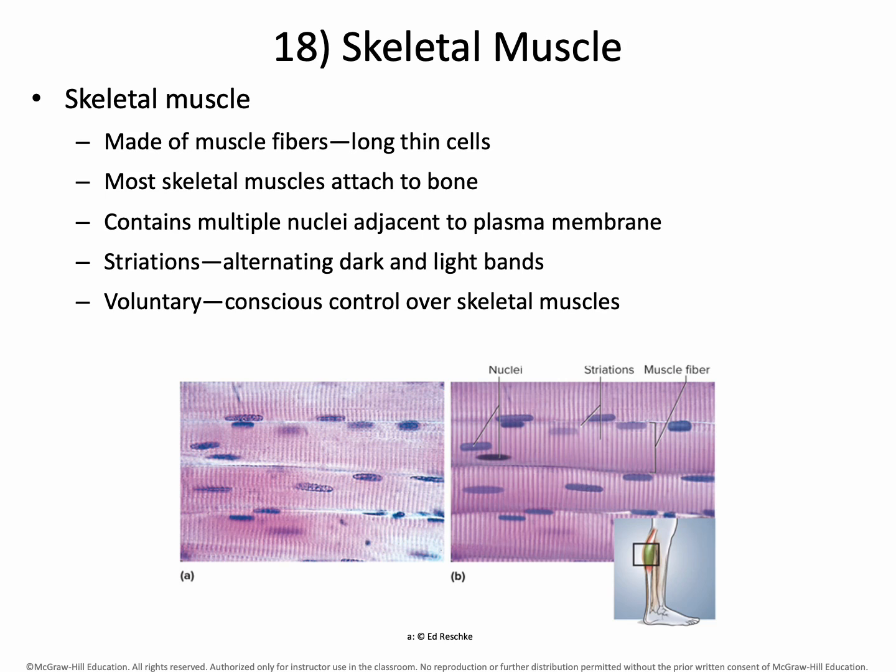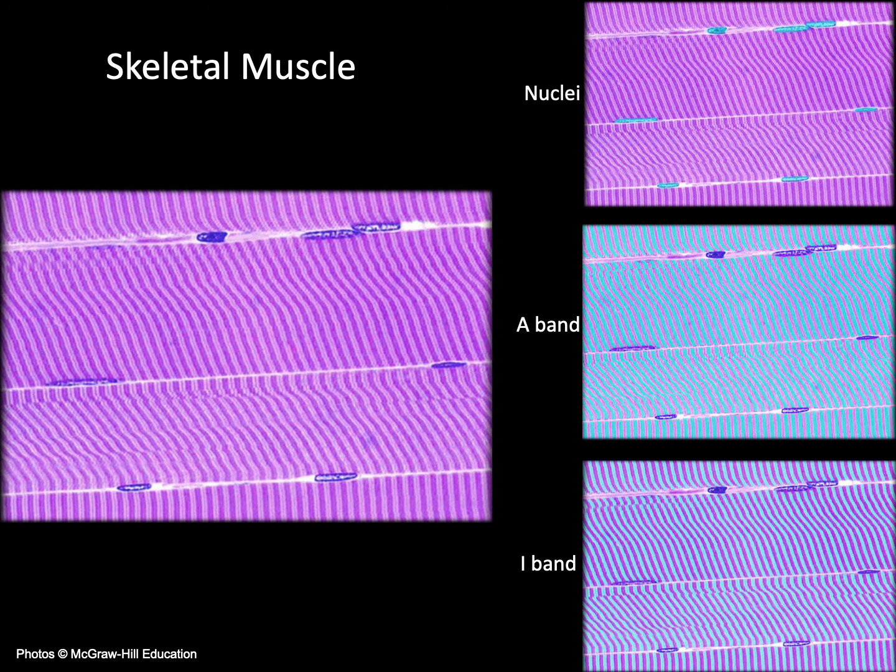It has striations, or stripes, which are the sarcomeres, the small contractile units, and it is multinucleated. Mature skeletal muscle cells are created from multiple cells that fuse together, each retaining their individual nuclei. So skeletal muscle has the large striations, with multiple nuclei pushed to the periphery.